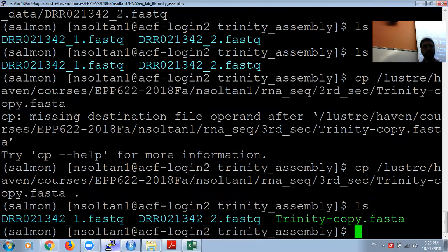After copying it, you will have a file called copy.fasta. Has anybody finished installing those Anaconda software? Did any? Okay.